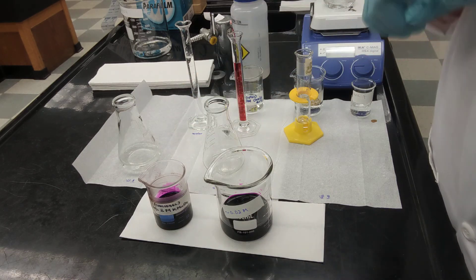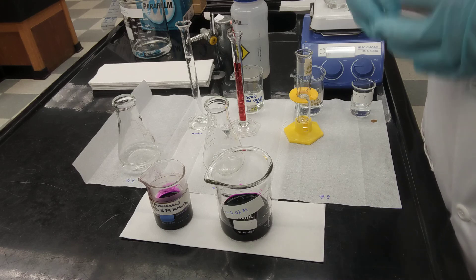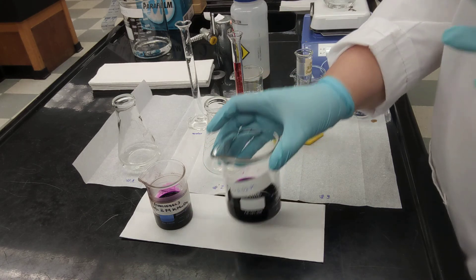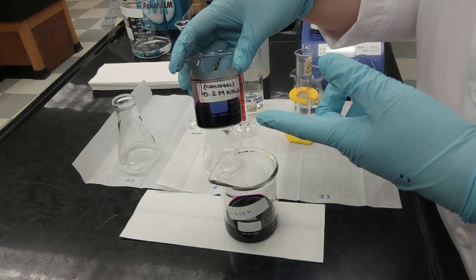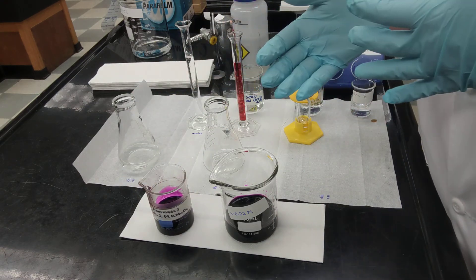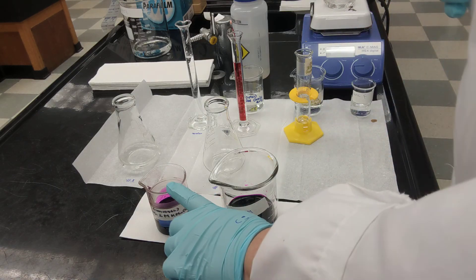Since you have an initial concentration of 0.2 molar, a final volume of 100 milliliters, and a final concentration of 0.02 molar, you can use those three numbers in the dilution equation to calculate what volume you need from your potassium permanganate with a concentration of 0.2 molar to prepare your new solution with a concentration equal to 0.02. The calculation gives 10 milliliters.